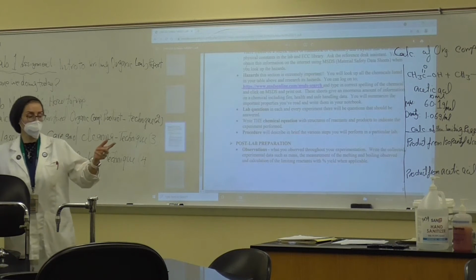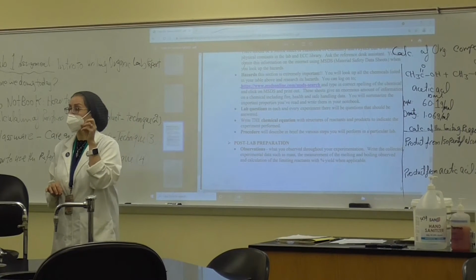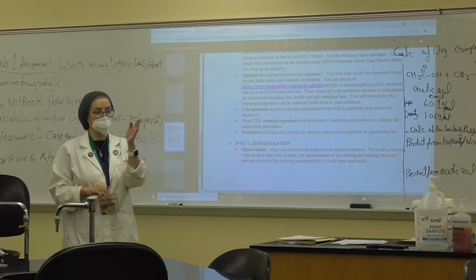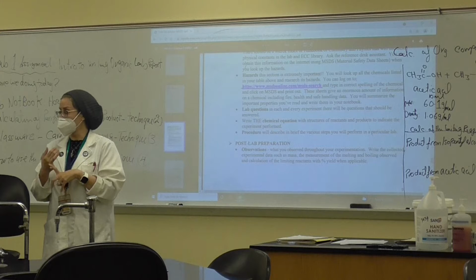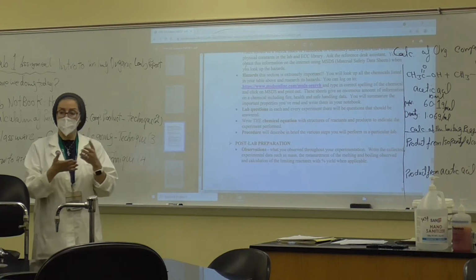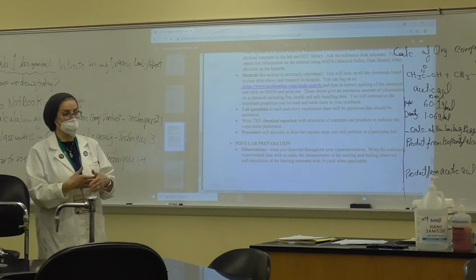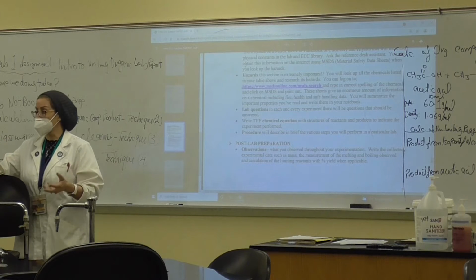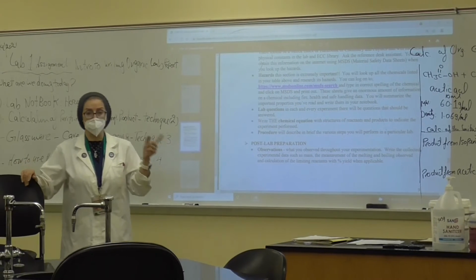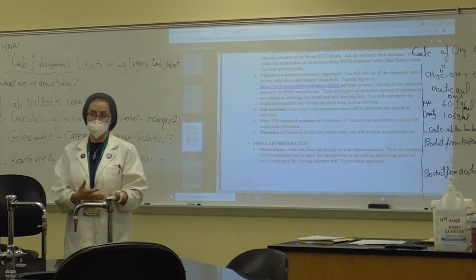And then later on, we are going to go through the way that we are going to collect data, okay? In other words, for every single chemical, how are we going to identify it? How are we going to write down, for instance, the melting point, boiling point, density, refractive index, and also the molecular weight and structure? All of this information will be found in those catalogs. So this is what we're going to do next.